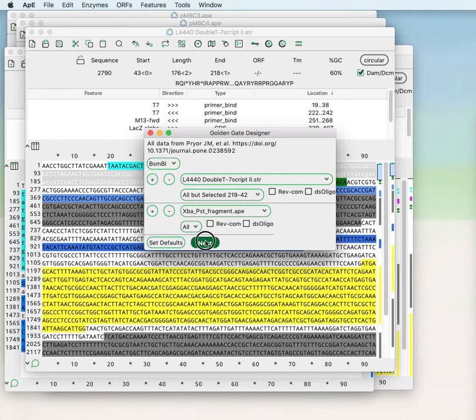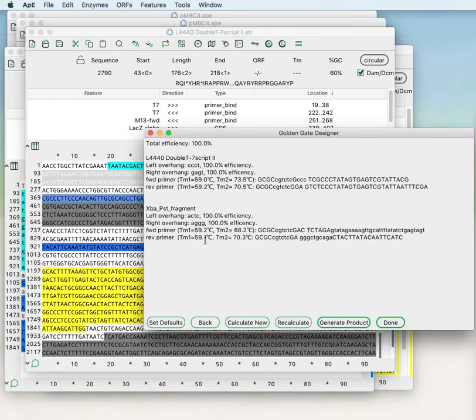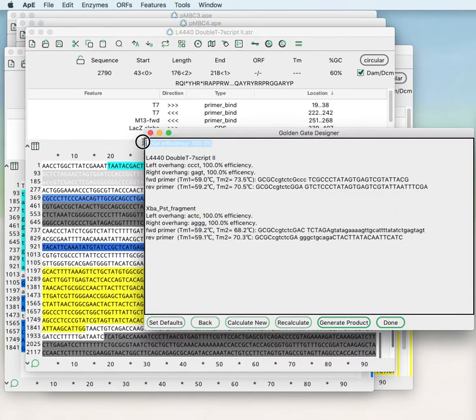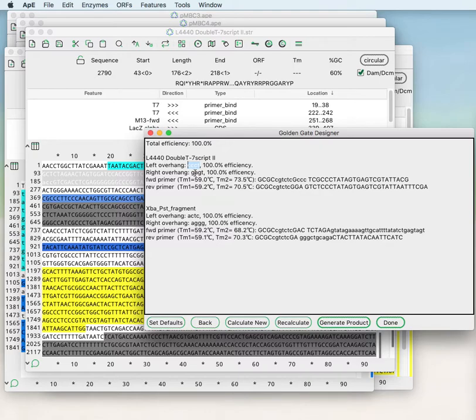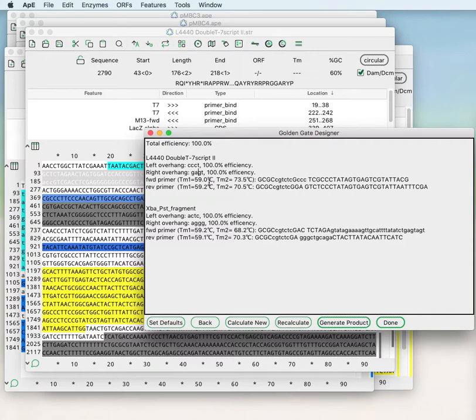If we choose next you see that it finds a total efficiency of 100% because the two overhangs that it has found have 0% cross reactivity which correlates to 100% efficiency. So there's no empirically found cross reactivity of these two single-stranded overhangs in a Golden Gate reaction.